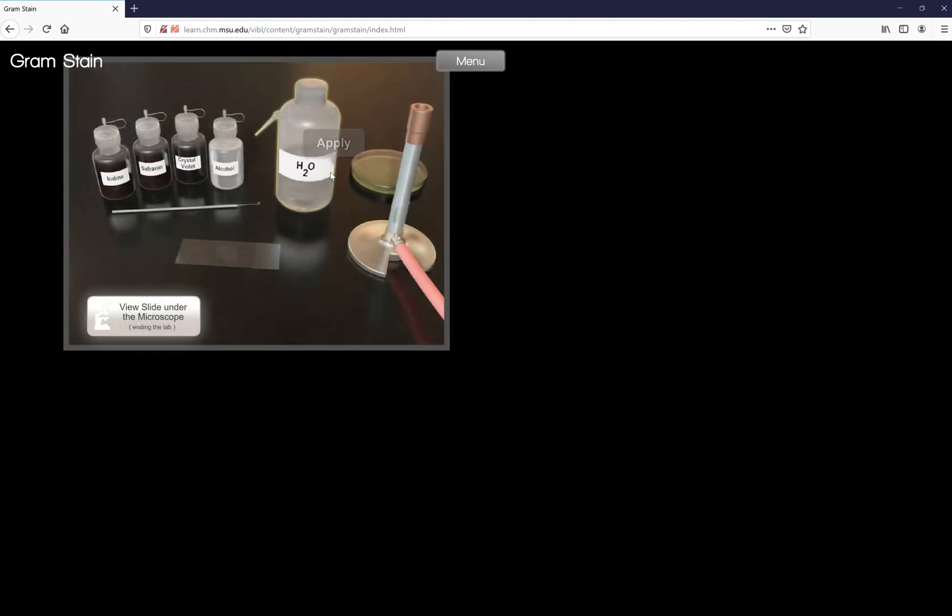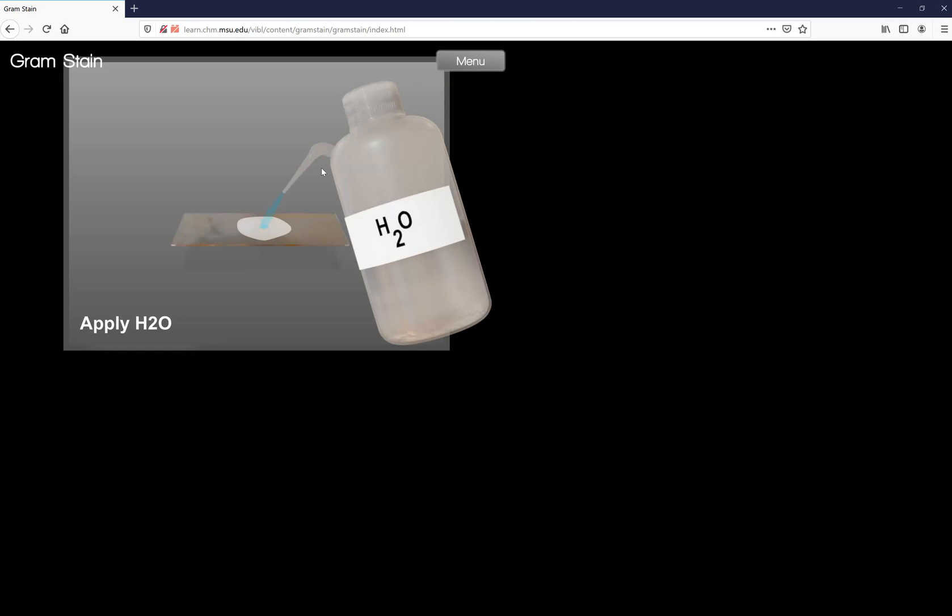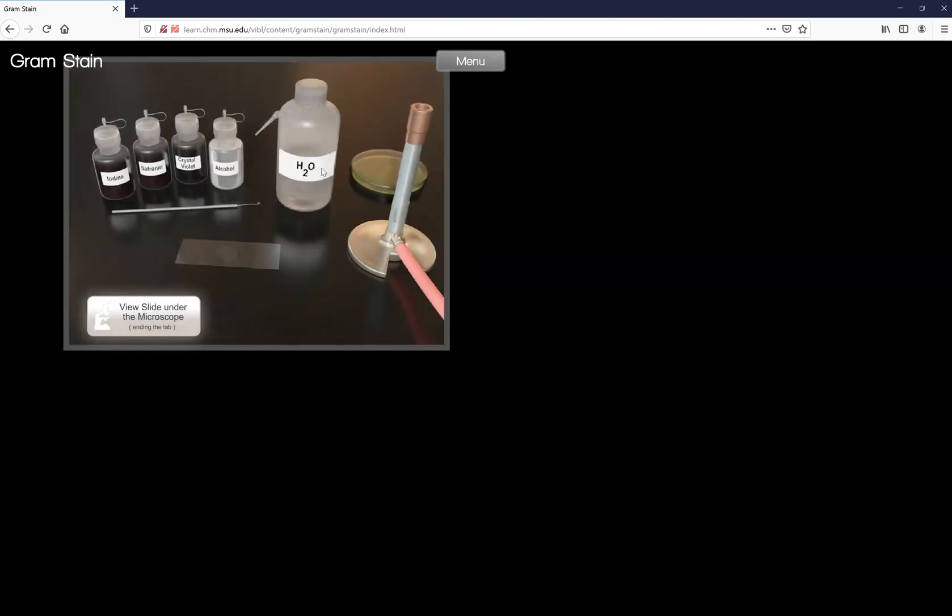We're going to drip it on there. We don't wait. Notice there's no timer. Instead we instantly rinse with water, H2O. So click on your water.